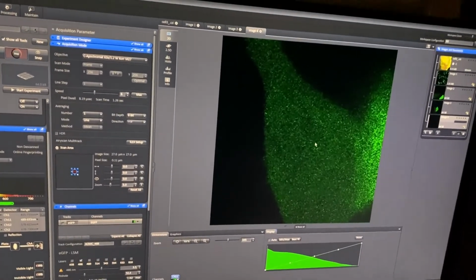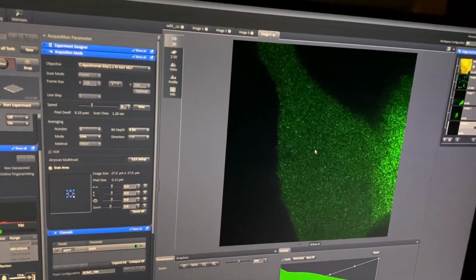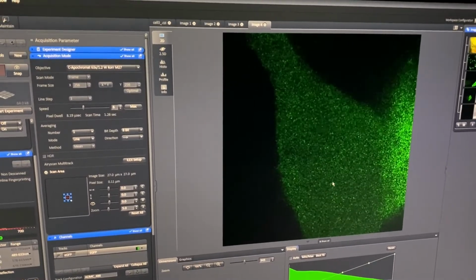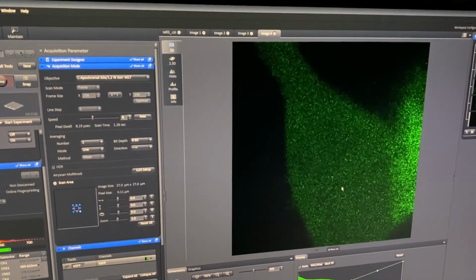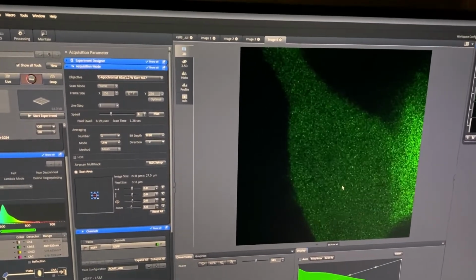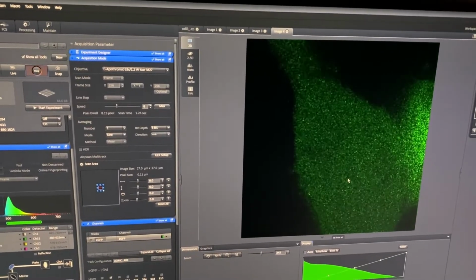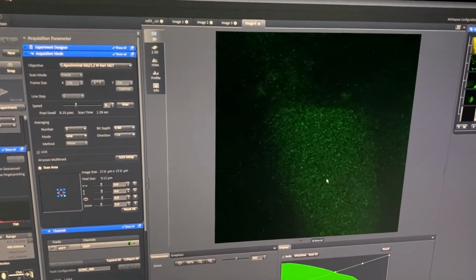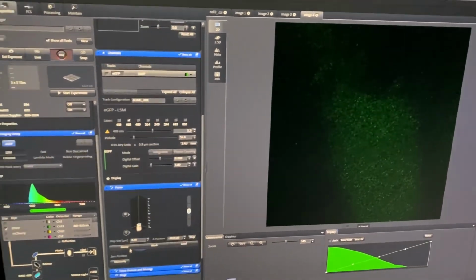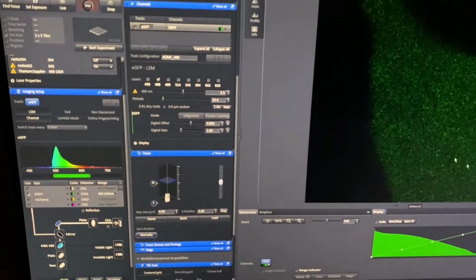You can clearly see that this is a GFP cell, because you don't really see the nucleus here; the expression level of EGFP is very similar in the cytoplasm as in the nucleus. I usually measure RICS 4 microns above the surface of the membrane for a cytosolic protein, and this is a cytosolic protein. So I'm going to focus on the membrane completely. I would call this the membrane, and I'm going to go 4 microns above the surface of the membrane. And this gets me here.